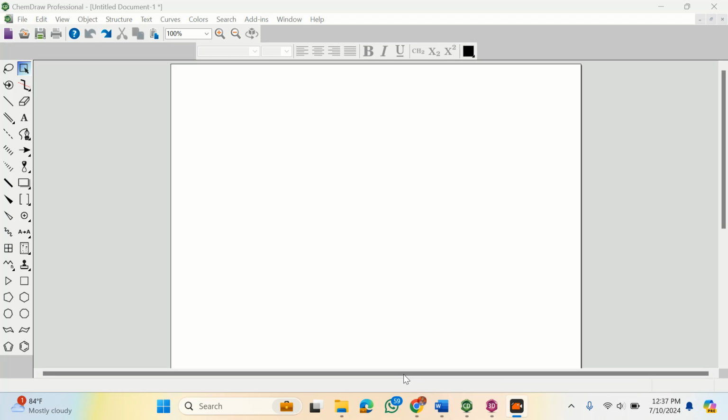So assuming the name is now Naproxen, which is what we'll be working with, right? If you leave this highlighted, it will paste it and then it will give you the name. Okay, let me just highlight that. So I'll click on that. This is now Naproxen. If you remember the compound, this is actually how it looks. So if I don't need this, I can take this off.